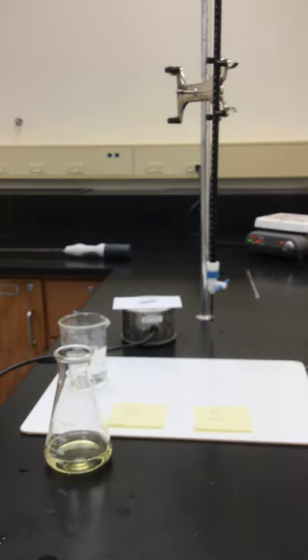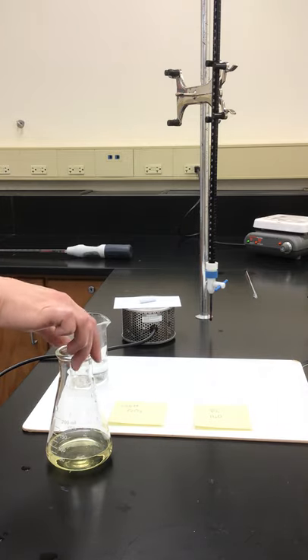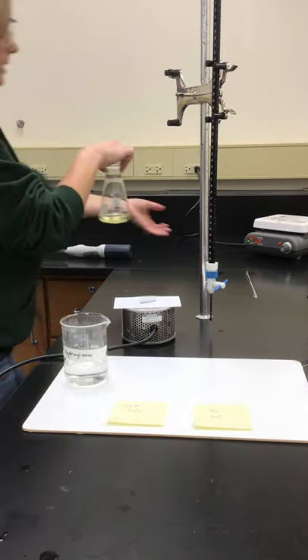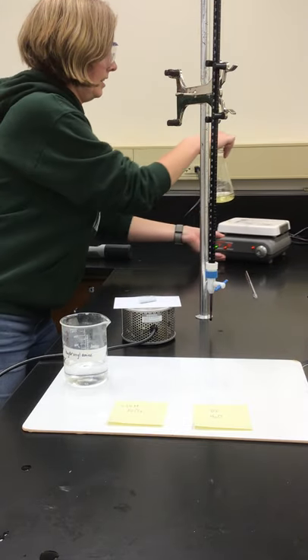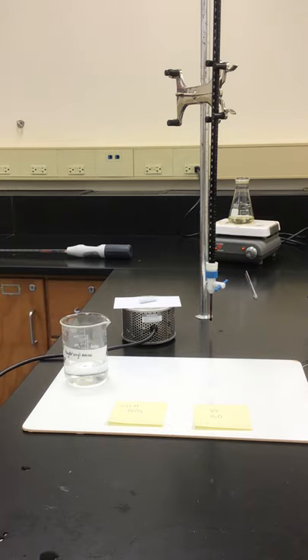We're going to take that flask and boil the solution for about five minutes, because we need that higher temperature for the reaction to complete. I'm going to put this on our hot plate — you can see it back in the background — and we'll come back in a few minutes after it's boiled for five minutes.